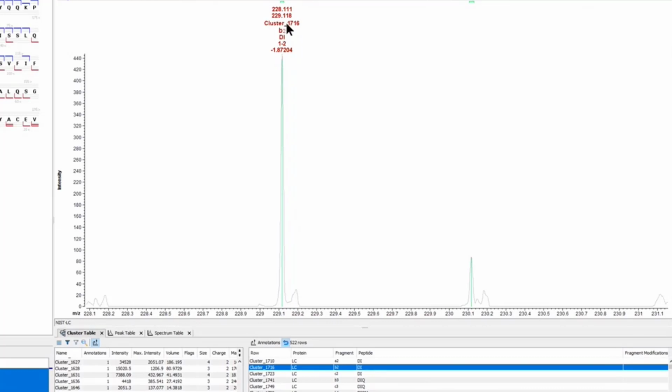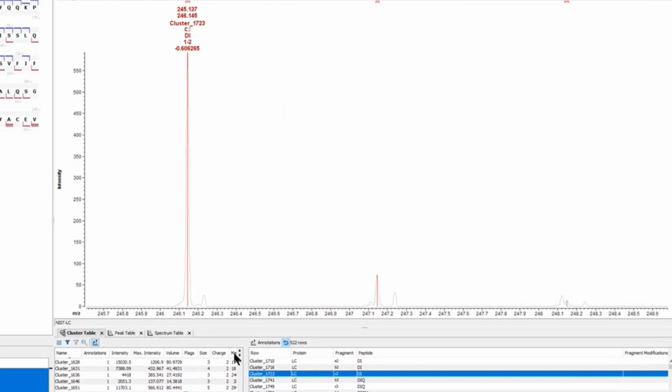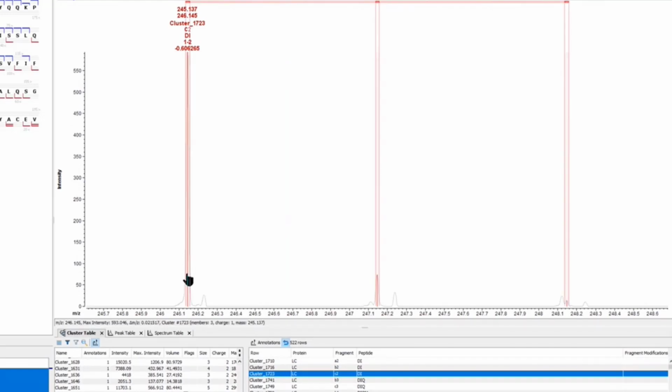And you can put all kinds of attributes here, whatever helps you and makes the job easier. I also have the ppm mass error listed on the very bottom. And then the same for C2. In this case, the C2 has, okay, so it's found 3 of the isotopes in its annotation.